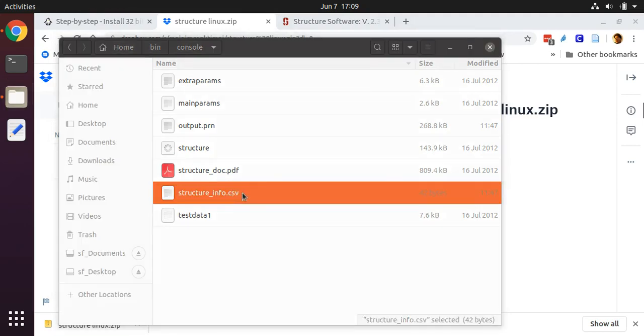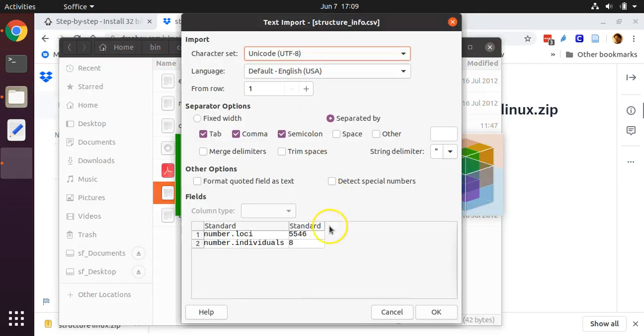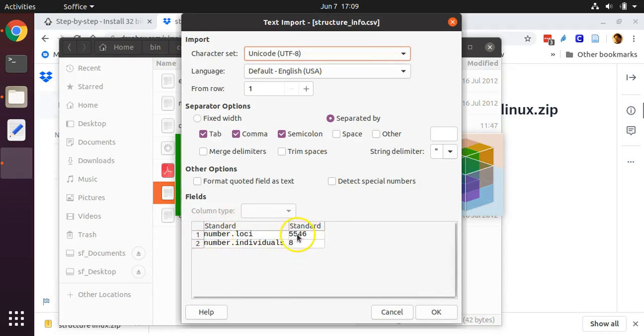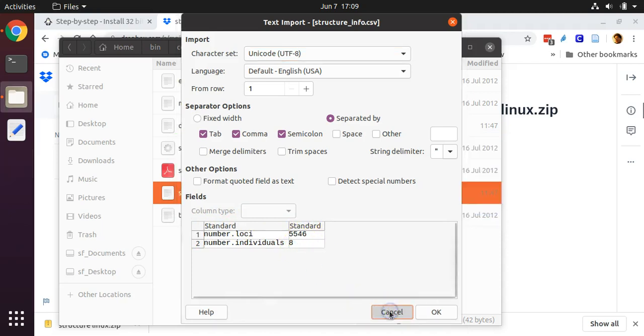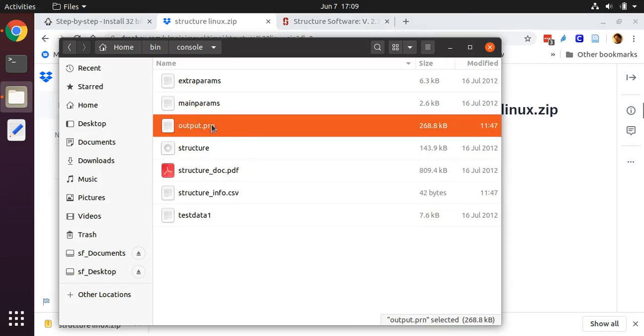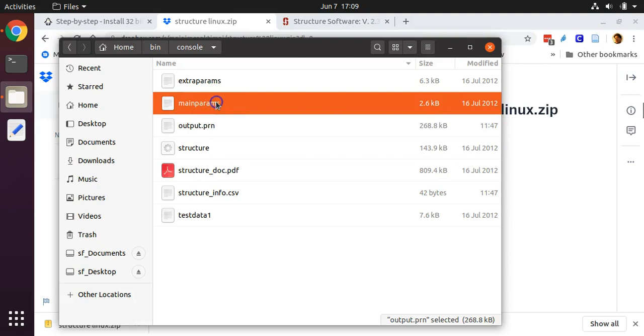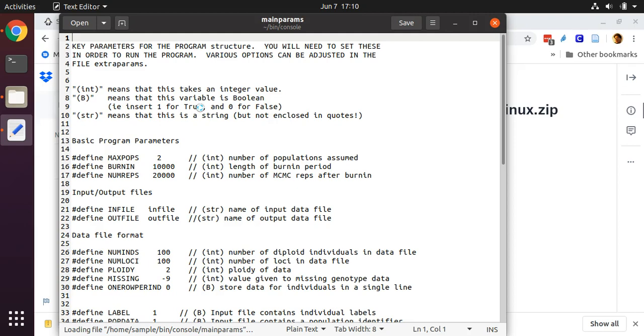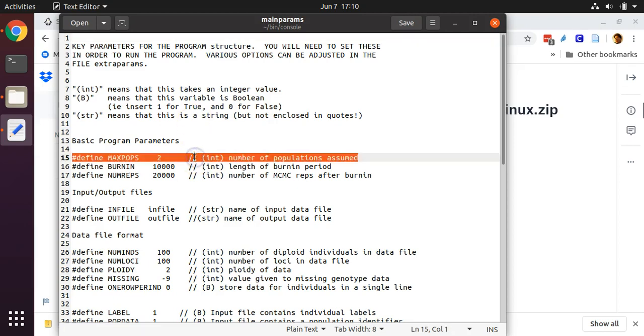If we double click on it, it'll attempt to open it in LibreOffice, but all we need is the information that's right here. The number of loci is 5546 and the number of individuals is 8. The no data character in my dataset is negative 999. I have my dataset set up so that it includes a row of marker names for the loci, as well as a column of individual names. So let's start by editing this file called mainparams.